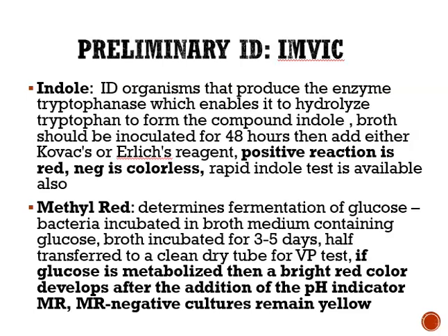So indole is a test that's used to identify organisms that produce the enzyme tryptophanase, which enables it to hydrolyze tryptophan to form the compound indole. So this is a broth. It should be incubated for 48 hours. And then we have to add another reagent, and you can use either Kovacs or Ehrlich's reagent.